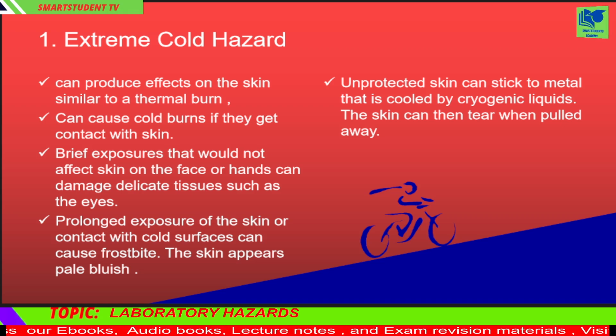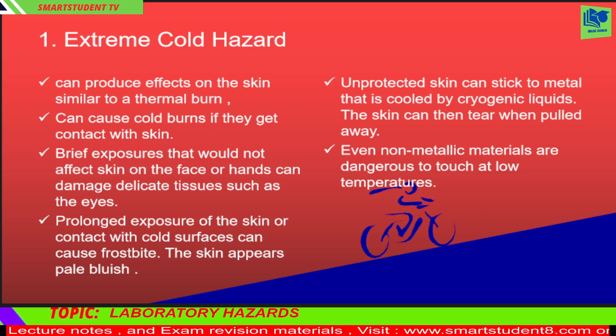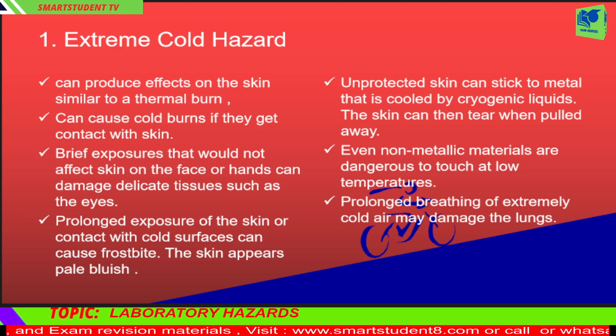Unprotected skin can stick to metal that is cooled by cryogenic liquids. The skin can then tear when pulled away. Even non-metallic materials are dangerous to touch at low temperatures. Prolonged breathing of extremely cold air may damage the lungs.